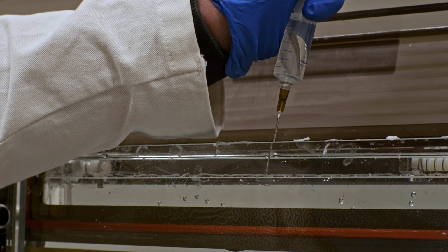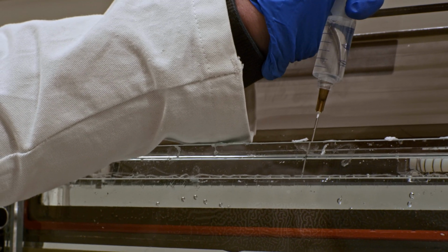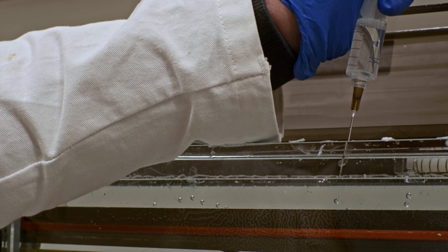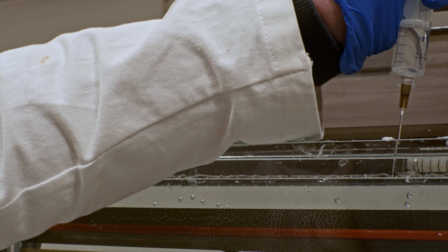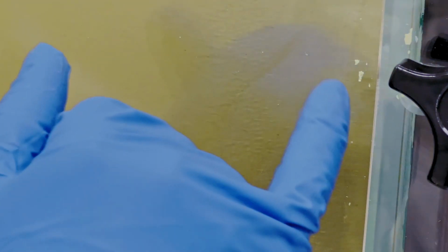The other thing to assess is to also look for bubbles that may have formed in your wells that weren't there originally before. So while looking on your gel over here, the potential sites you want to put your samples, see if downstream of that well there's an imperfection. So for example, I do have a couple of bubbles around some of these wells, but some of them are so far down that my gel will actually never run there, so I don't really care about that.